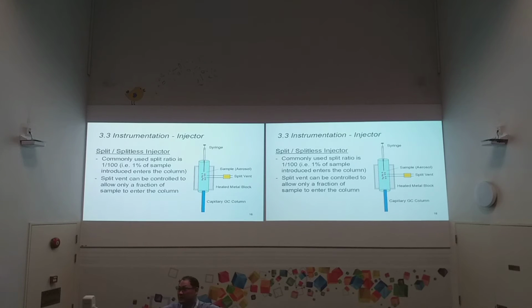But then, if that's the case, do we need a big room, 30 meters in length? Do we need a chemistry lab 30 meters in length to house the instrument, because the column is 30 meters? No need. Because the capillary column is so tiny, it's just like our hair, right? So you can roll it up, and then you just need a tiny space to house the capillary column. So that is what chemists developed.